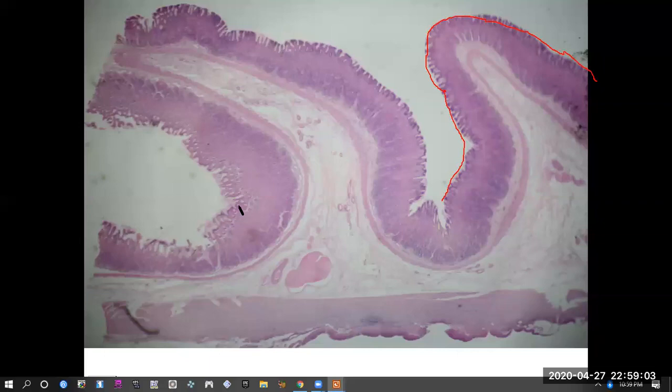So again, with the tunic layers, we can start at the very surface. And at the absolute surface, we're now going to see simple columnar epithelial tissue. Simple, just a single layer. Again, there is that second subdivision for the tunica mucosa. And then we see the pink line here, the muscularis mucosae. So making this entire bracket the tunica mucosa.